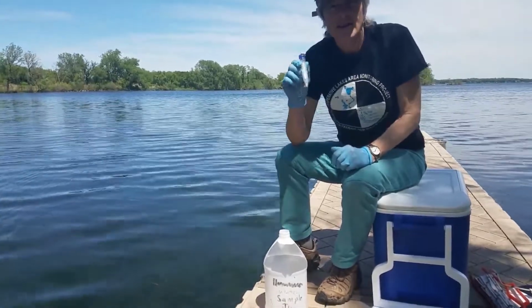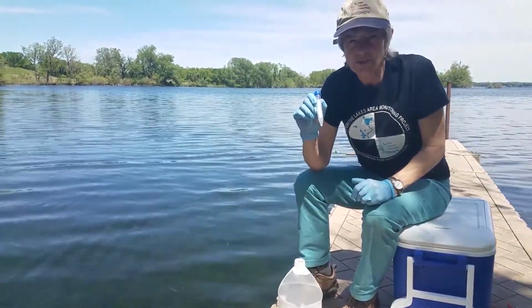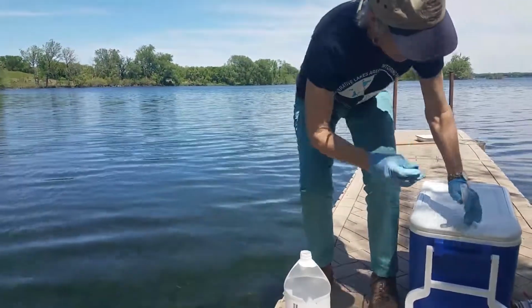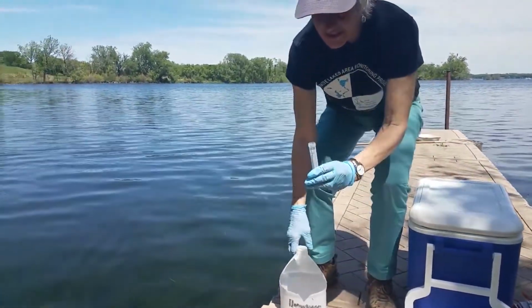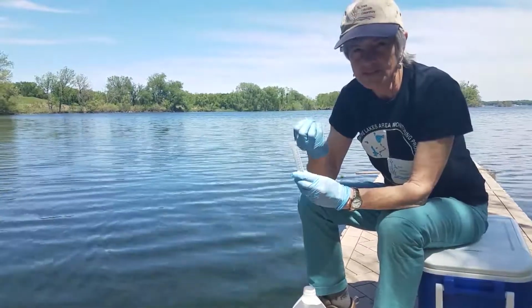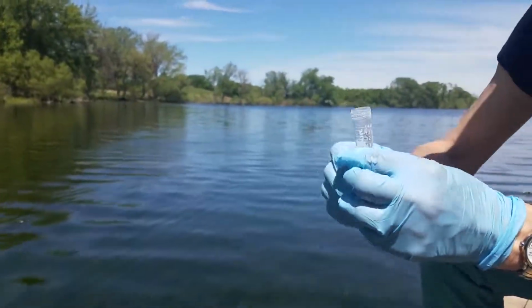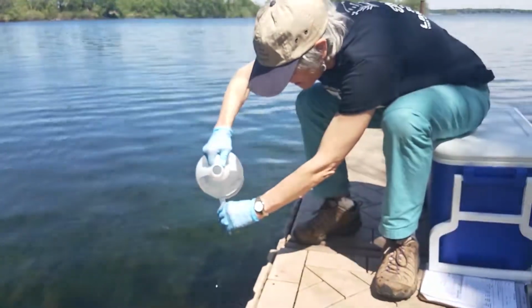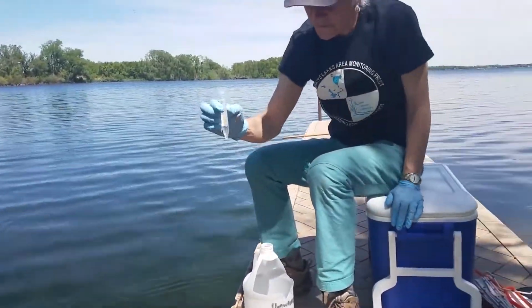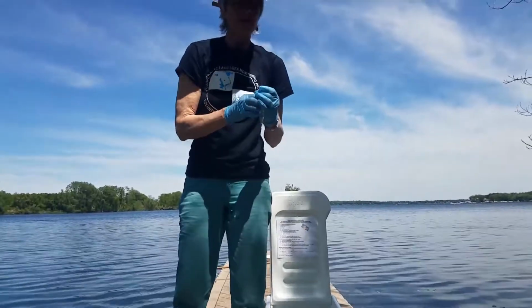This little vial is going to be our sample to test for the presence of microcystin, which is a type of toxin that can be produced by some kinds of cyanobacteria or blue-green algae. You take the cap off, give it to your partner, or store in a safe location. When we bring this sample back to the lab, we're going to freeze it. So we don't want to fill it all the way to the top because as water freezes, it expands. We only want to fill it up to the 11 milliliter, not millimeter mark. Just pour the sample in there. Might have to dump out a little bit. And that's good to go. So put that in. We've completed our water sample and our pH measurement.